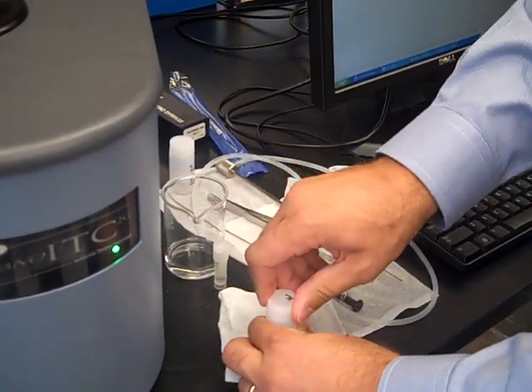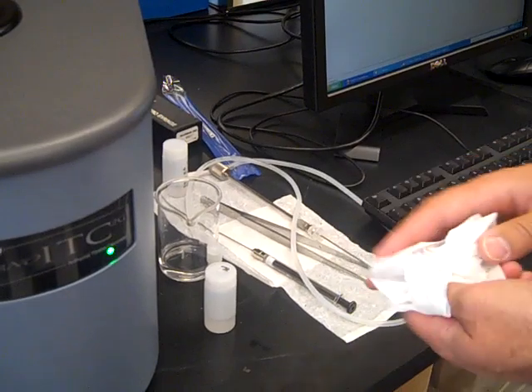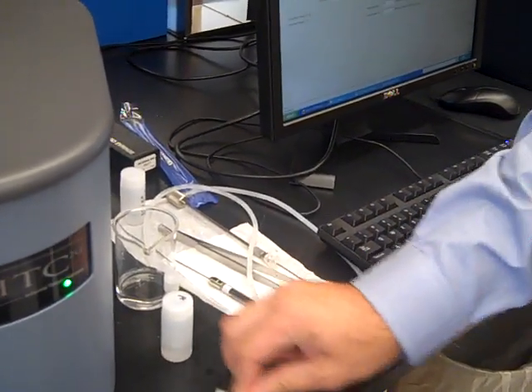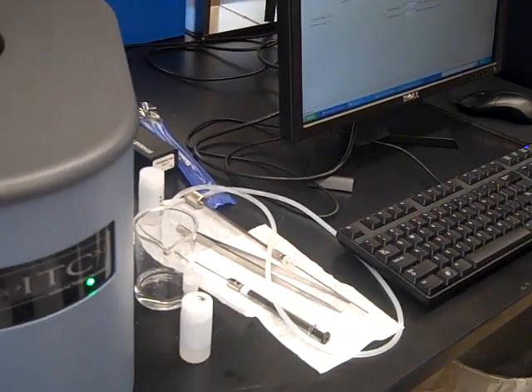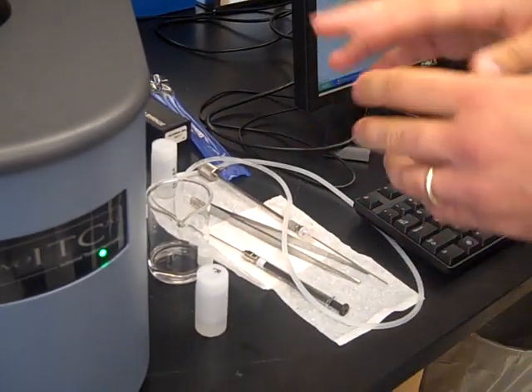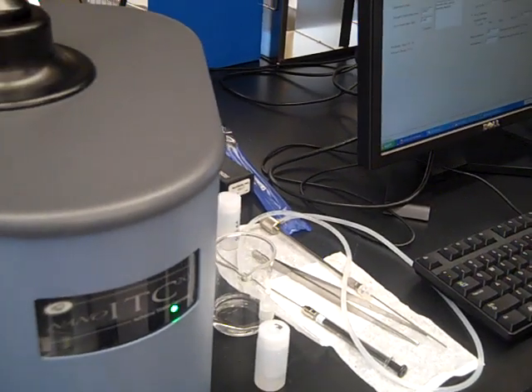For faster turnaround, it might make sense to have a duplicate set of syringes so that you can, if you wanted to do one reaction after another, load it up and then do that. Yeah, and then you could do the cleaning and stuff while you're running your experiments. All things are already done.